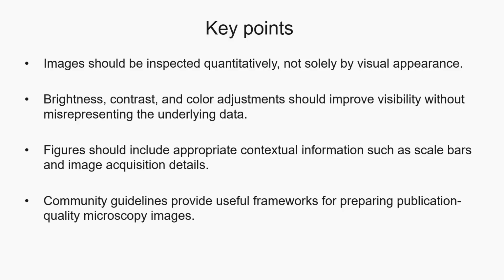Good figures also provide appropriate context, including scale bars, labels, and sufficient methodological information for others to understand what they're viewing. Transparency is essential. Any processing or visualization steps should be clearly documented so that figures remain reproducible and scientifically trustworthy. Following established community guidelines can help ensure that image data are communicated accurately and consistently.